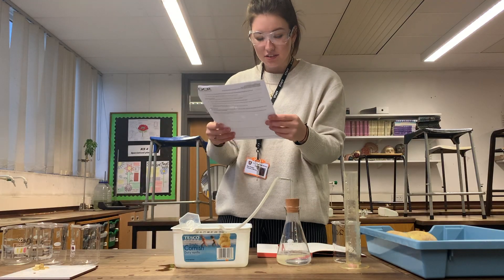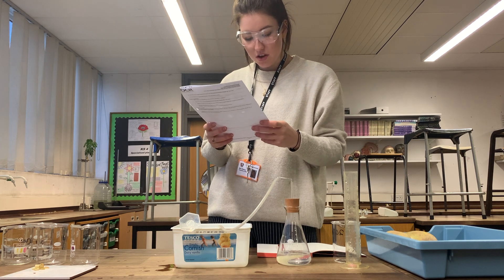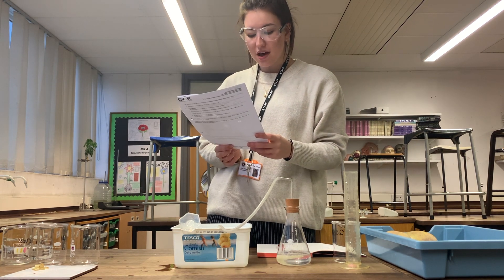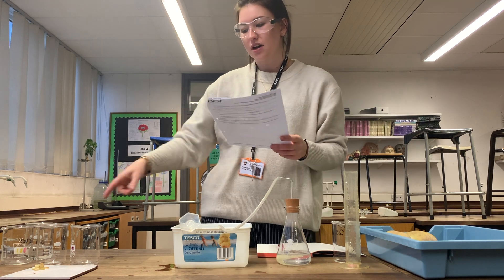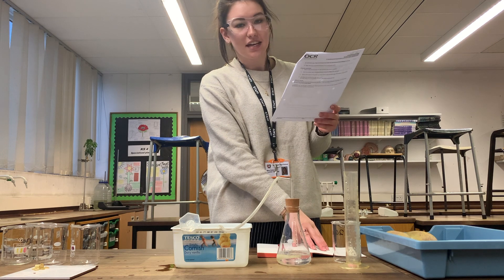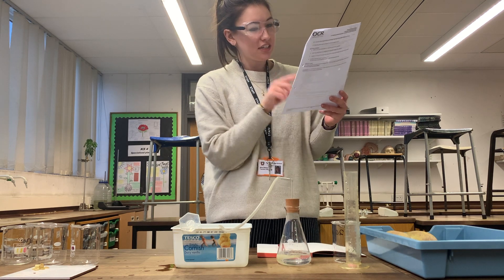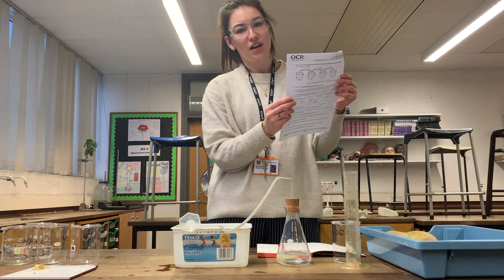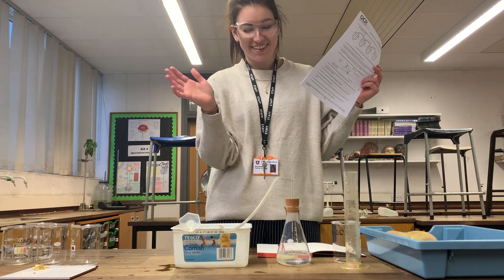The next instruction on the sheet is to exchange your data with other people so that you have three values for each of our hydrogen peroxide concentrations. You'll be given some student data and then you'll be able to work through steps 15 to 17 yourselves. There are also four extension questions to answer.